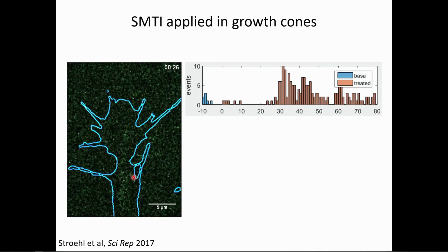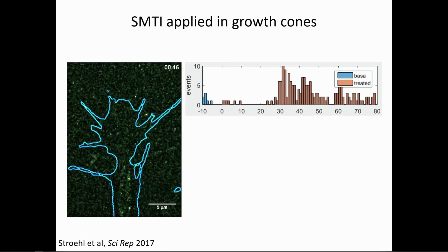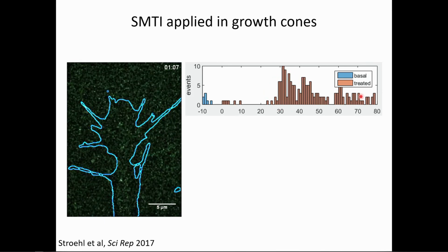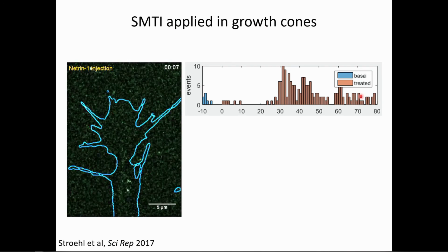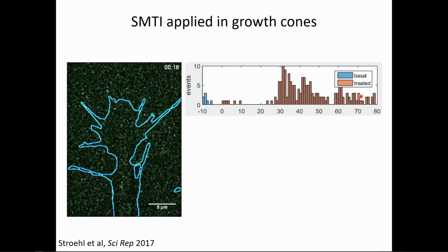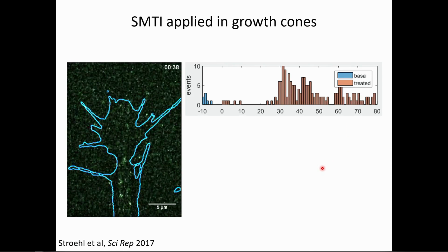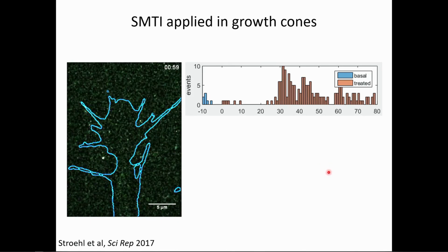And what this tells us, so you see these are events, these are essentially protein synthesis events inside this thing. And this can be correlated directly with diseases that cause growth defects. It can be correlated with drugs you may administer to play with certain processes inside the neuron, and so on.